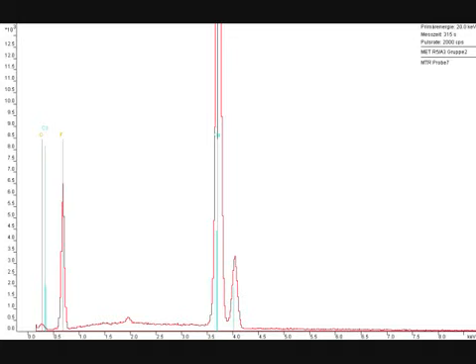But how do you know it's an escape peak? Well, the thing is that this escape peak has the actual energy of the parent, like the calcium, minus the energy of the actual silicon K-alpha photon. So that's what determines this as an escape peak. Quite a fascinating phenomenon, I believe. And while that always happens to some extent, you can only see it in very few minerals because the magnitude of that escape peak is also dependent on the actual composition of the materials. So this is a very rare sight to be actually able to see this clearly.